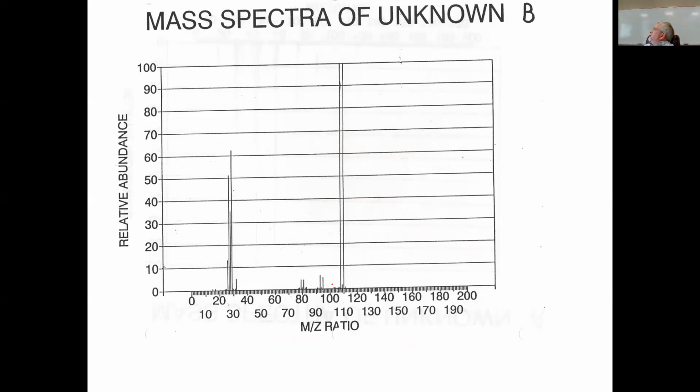Where's the molecular ion peak? So would it be the very right? Yeah, the far right. And not the bromine? Yeah, exactly. This is 110 and this is 108, which makes sense. If they're equal in size and there's a difference of 2 between them, then you would have to subtract the bromine from the overall. Think of bromine.